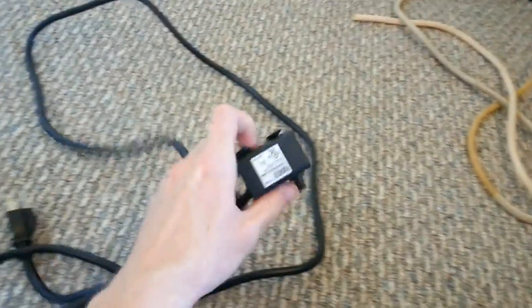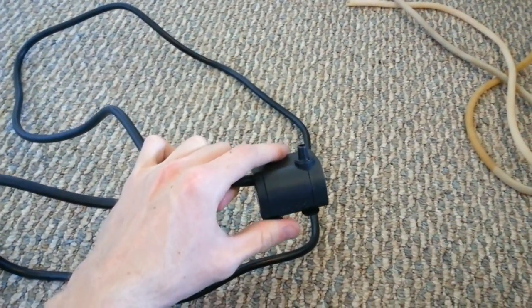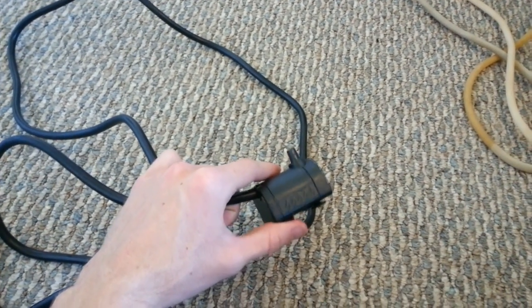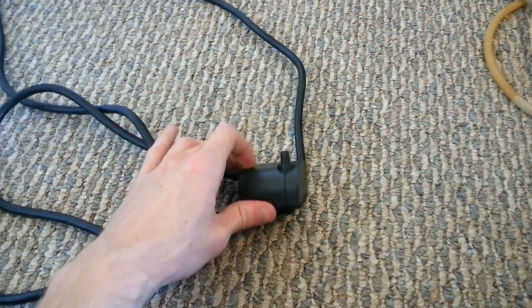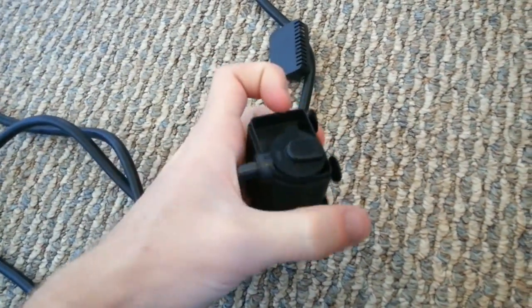This is just a little pump that I bought at an aquarium store — it's something like 90 liters per hour. It's just used for putting water through the tubes through the condensing column. It does not need to go fast. This was like $15. It's just a little impeller inside, and these are really good in case you get any kind of hair or gunk inside your water reservoir — you'll be able to clean it out pretty easily.